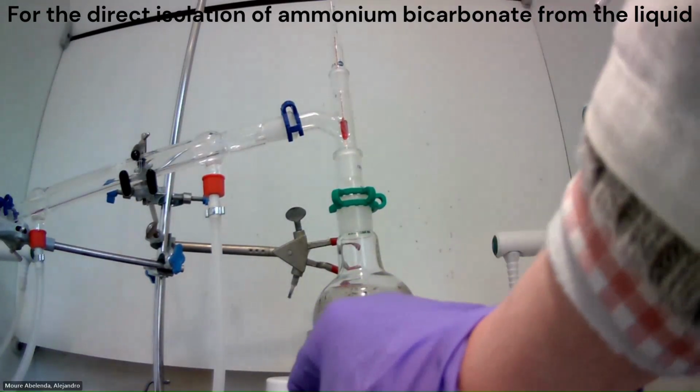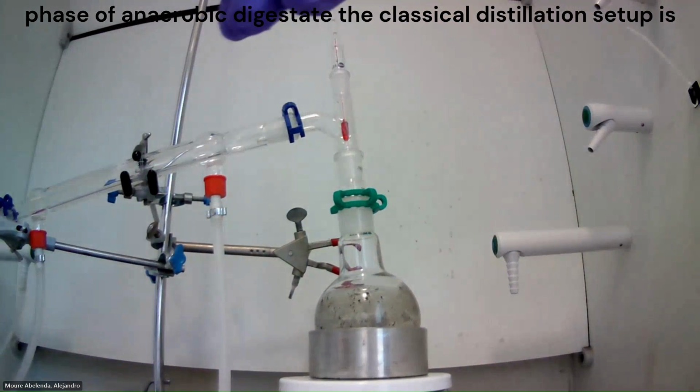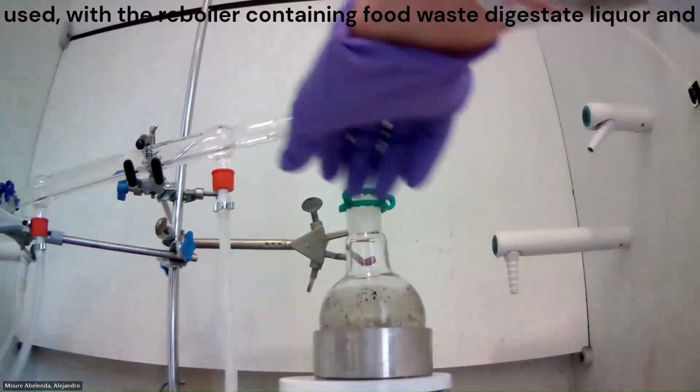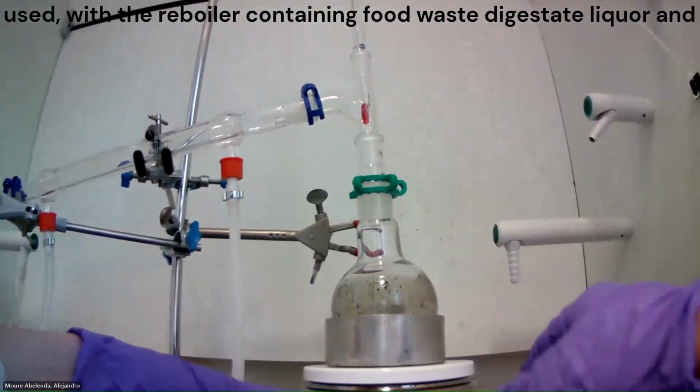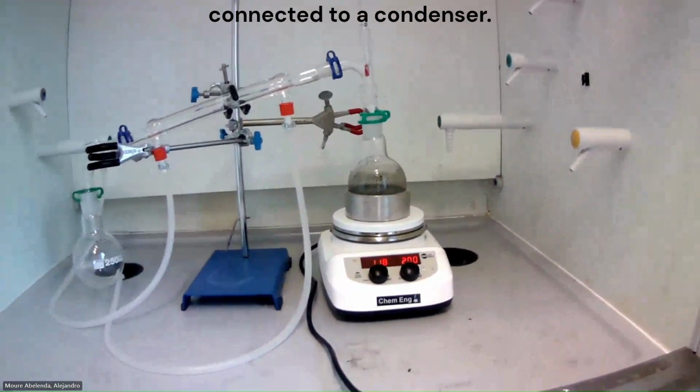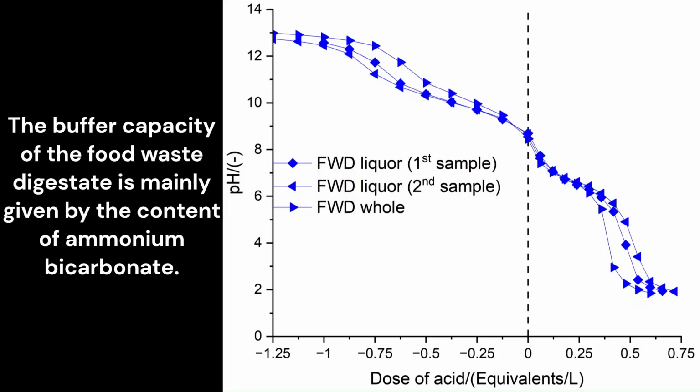For the direct isolation of ammonium bicarbonate from the liquid phase of anaerobic digestate, the classical distillation setup is used, with the reboiler containing food waste digestate liquor and connected to a condenser. The buffer capacity of the food waste digestate is mainly given by the content of ammonium bicarbonate.